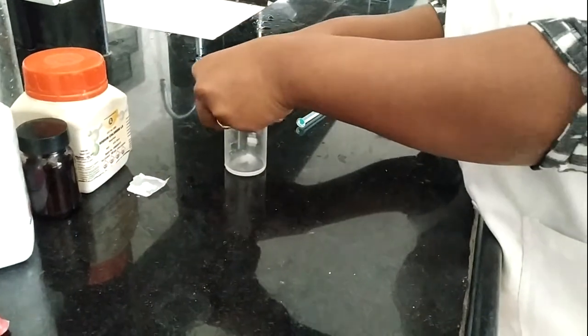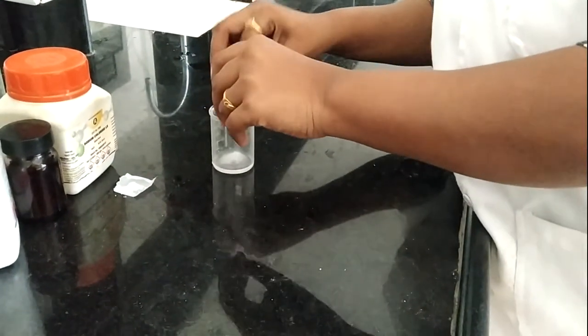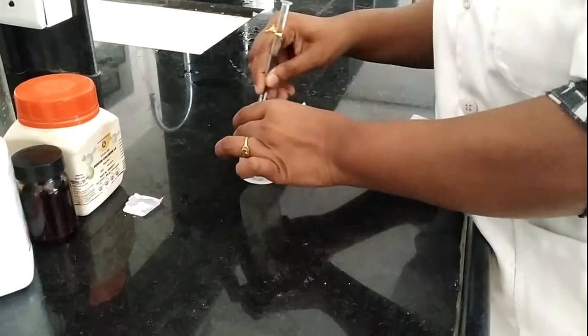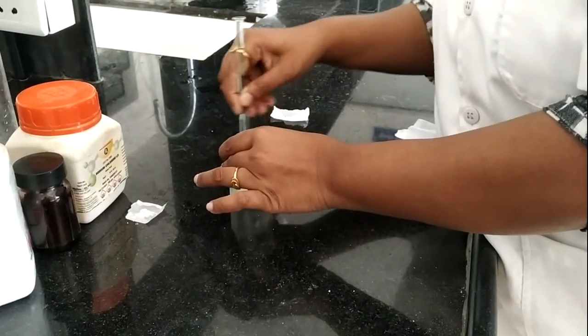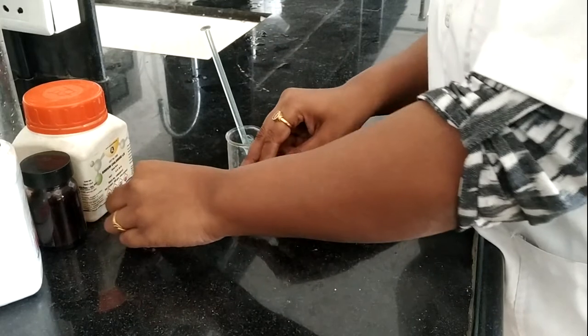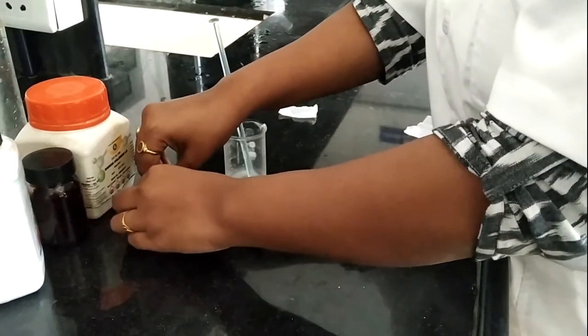First of all we are adding ephedrine hydrochloride, then this is chlorobutol. After that we are going to add this sodium chloride into it.